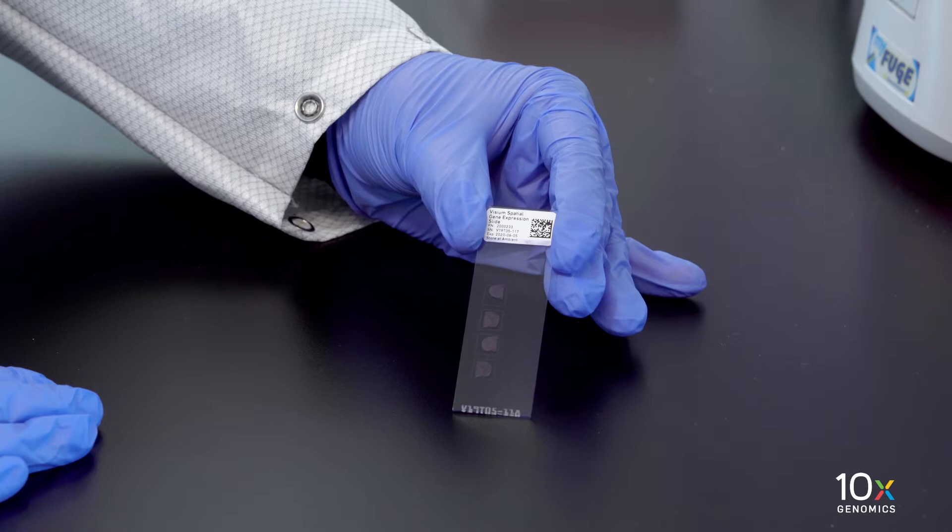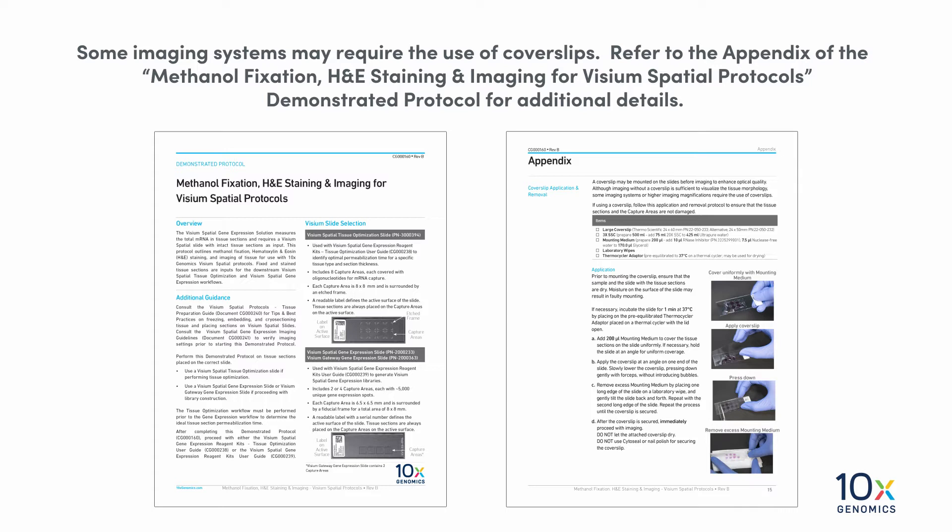We have fixed and stained the tissue. We are now ready to image the tissue using brightfield settings. We have our Visium spatial gene expression slide with the fixed and stained tissue.